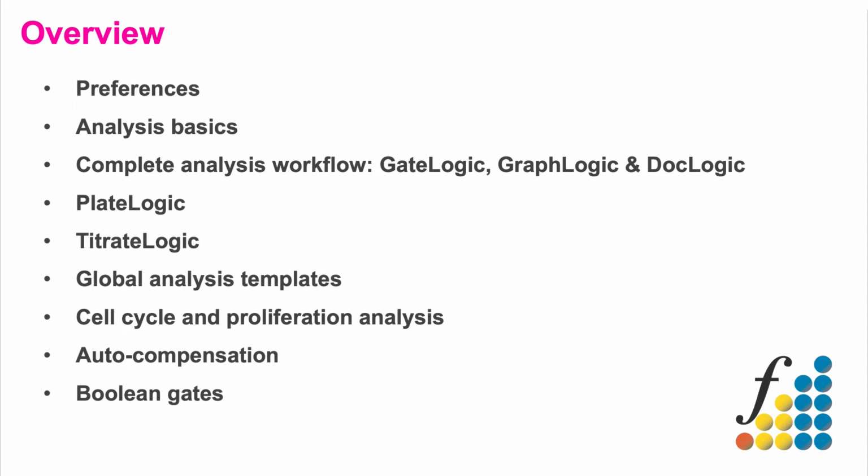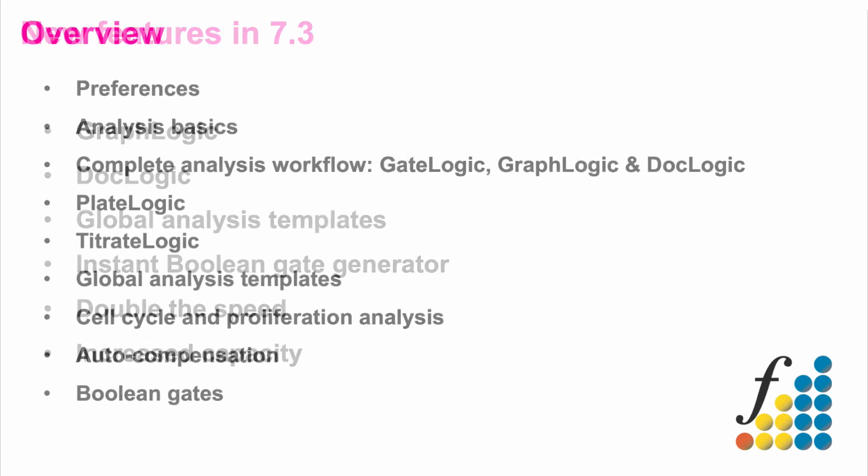before moving on to some of the more advanced features, including PlateLogic, which can be used to generate heat maps and screen plate data and other large data sets, Titrate Logic, an automated titration analysis tool, the new global analysis templates, which can include everything from gates right through to reports. I will demonstrate cell cycle and proliferation analysis, auto-compensation, and Boolean gating.